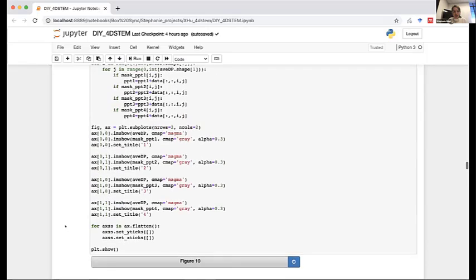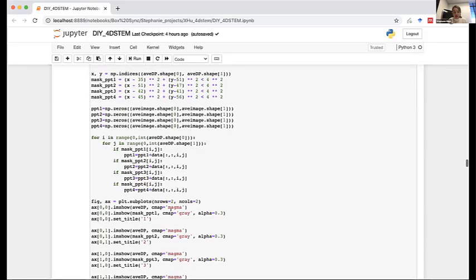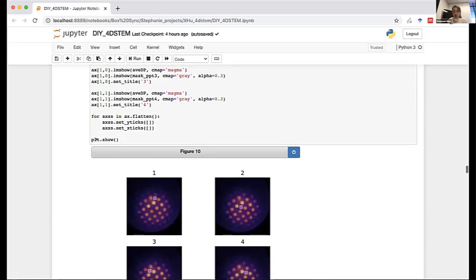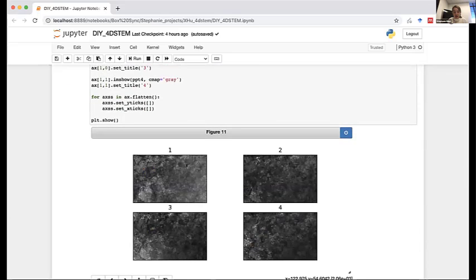This kernel looks a little bit longer, but it's really just the same thing that we've been doing repeated 4 times. So nothing new is added here. And then we can plot all 4 of them. So we have these 4 resulting images. They have very similar information, but maybe slightly different. And you could argue whether there's some sort of symmetry breaking in your sample or whether it's just that I didn't align the masks perfectly. So that's analysis for another time.